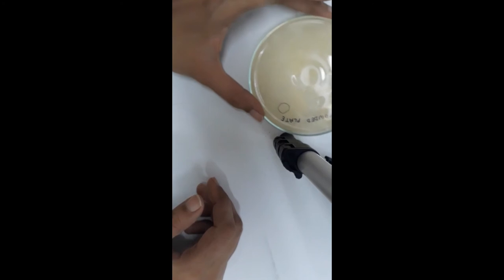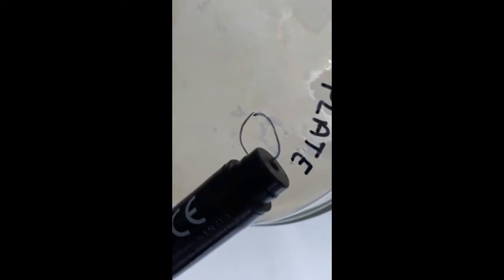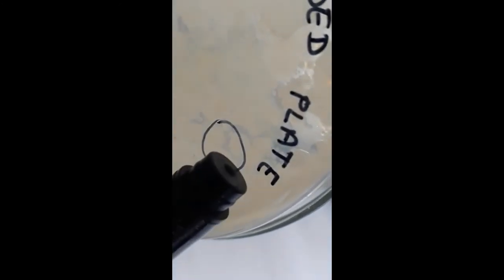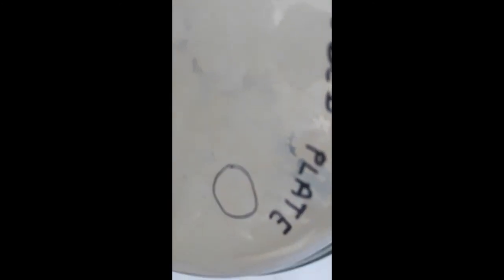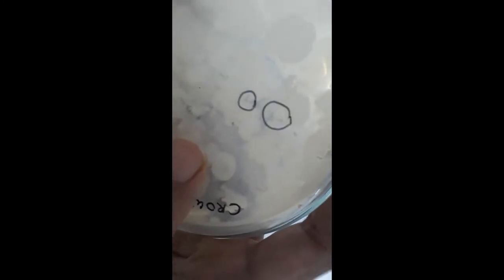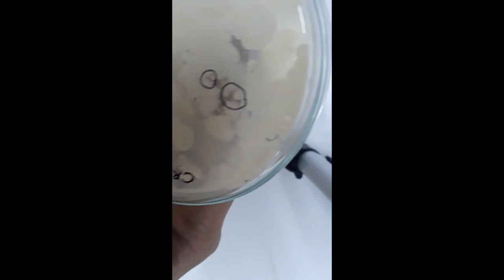Looking at the results of the crowded plate technique, we had incubated the plate for around 24 hours at 37 degrees Celsius and let the organisms grow. After the growth, what we are seeing here is that there is a distance between two colonies. The central colony is pushing away these other organisms, which means that the central colony is producing some antibiotic substance which is not allowing rest of them to grow near it.